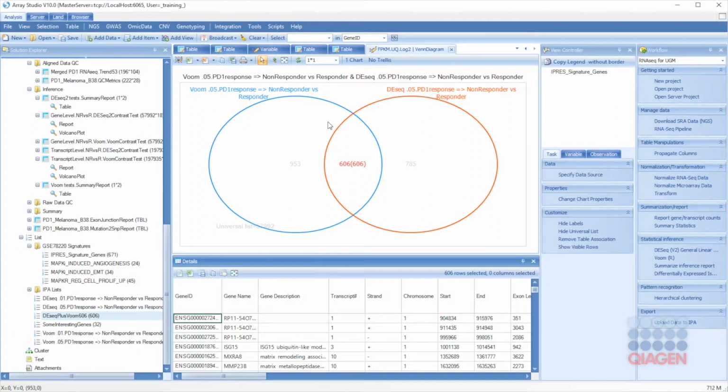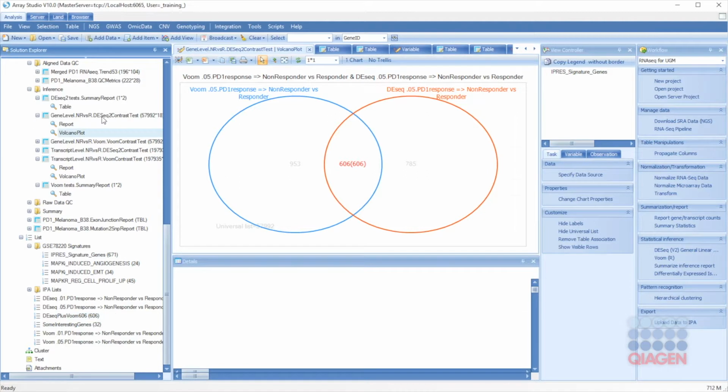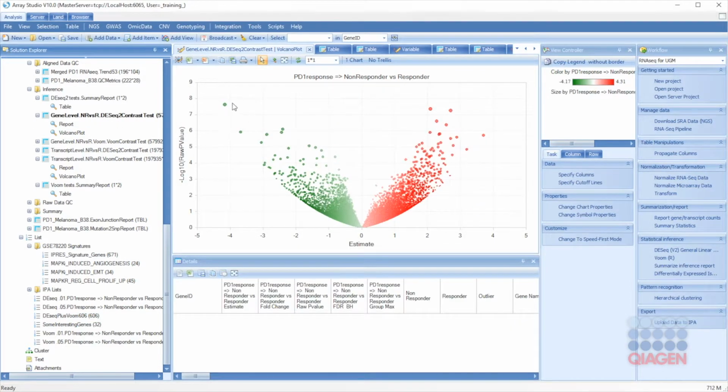It's a recent feature that we've just added, and it allows us to custom annotate any of the tables based on the contents of lists. So let's go back to our Volcano plot of the results of DE-Seq2, and let's say we had a list of genes in various gene sets. For example, gene signatures from another study. For example, I've got a collection of 3 different signatures showing different gene responses according to MAP kinase inhibitor treatments. And these are somewhat overlapping, but there are also unique members within each of these. And I want to see where each of these genes are within this result set.